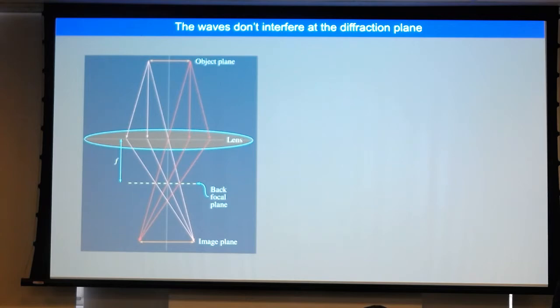And the electrostatic charge happens to be about the right amount to shift the phase of the electrons going through that spot. A tricky thing about this so-called Volta phase plate is that the longer you expose it to the intense beam, the more charged up it gets, and so the phase shift that it imposes changes with time. That's one of the hassles of working with a Volta phase plate: you use it for a while, then you have to move to another place because that spot has deposited so much gunk there, or somehow charged up so much, that it shifts.